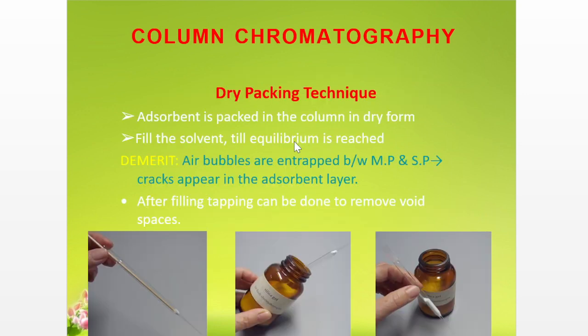Dry packing technique. Adsorbent is packed in the column in dry form. Fill the solvent till equilibrium is reached. Demerits: air bubbles are entrapped between the mobile phase and stationary phase, and cracks appear in the adsorbent layer. After filling, tapping can be done to remove void spaces.